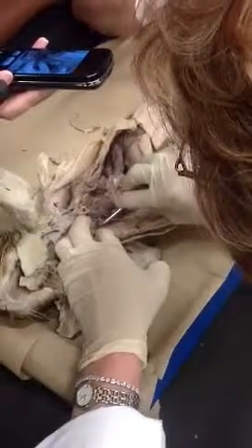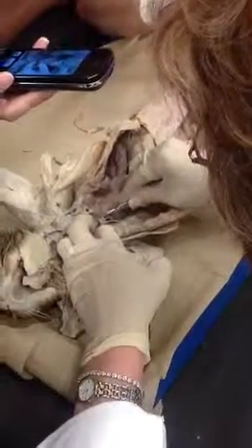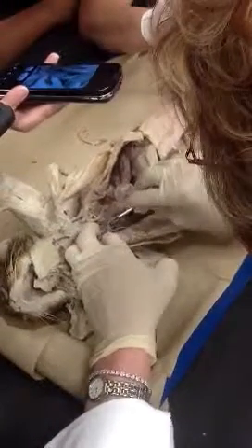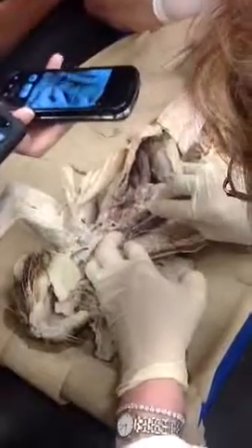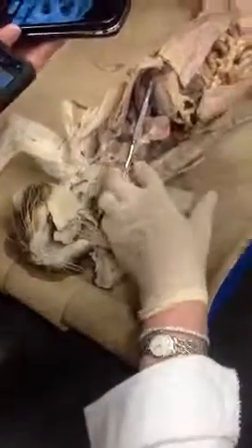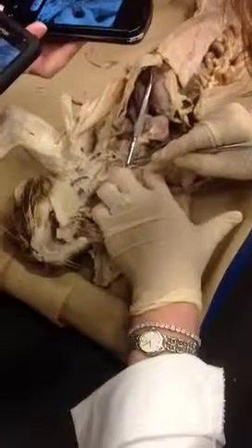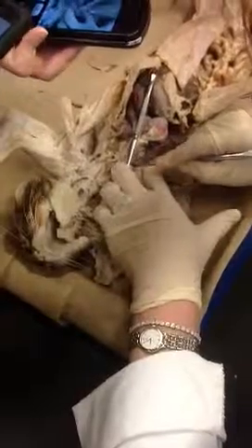This cat doesn't want to make it easy for us, but we'll do that. All right. Vertebral's that one. The loop right there is the costocervical. The next one is the thyrocervical. So it's 1, 2, 3. What I try to do, like I said, this cat's not helping too much, but pull all 3 of them up like that. Some cats, most cats, kind of separate out that one. There it is, a little bit better.